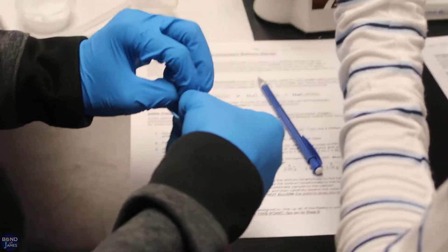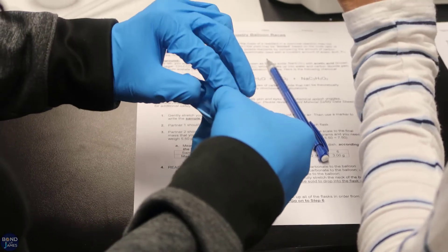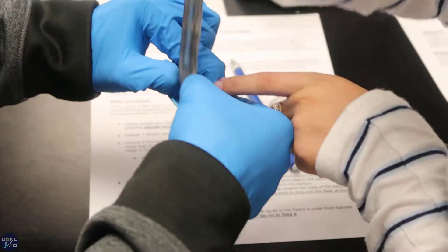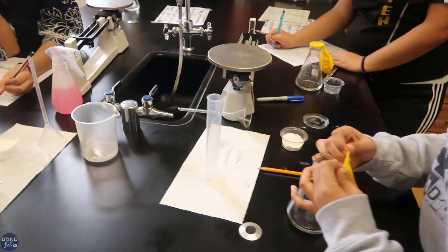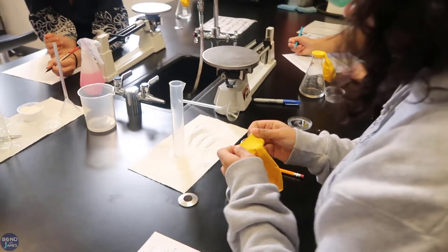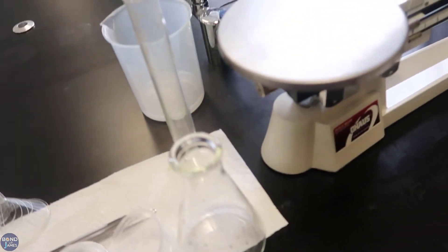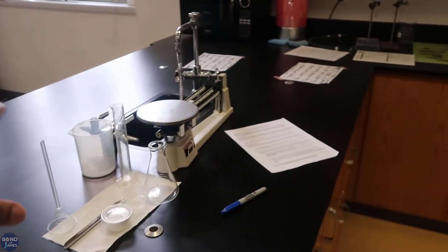They all had 25 ml of vinegar. From there, they took the spatula and placed the baking soda into the balloon, then took the mouth of the balloon and covered the mouth of the flask without adding the baking soda to the flask yet.